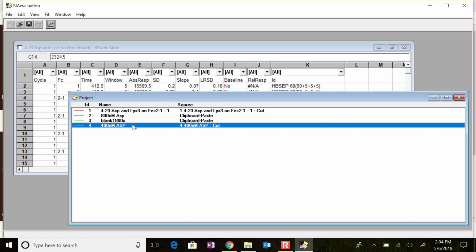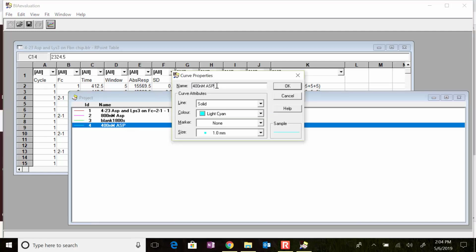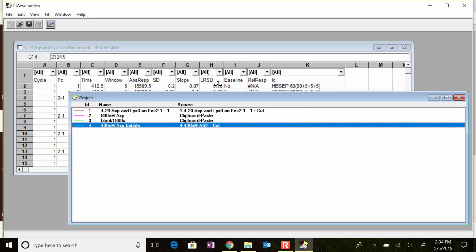So, and I could even rename it. I could say 400, and I could say ASP, and I could say bubble.